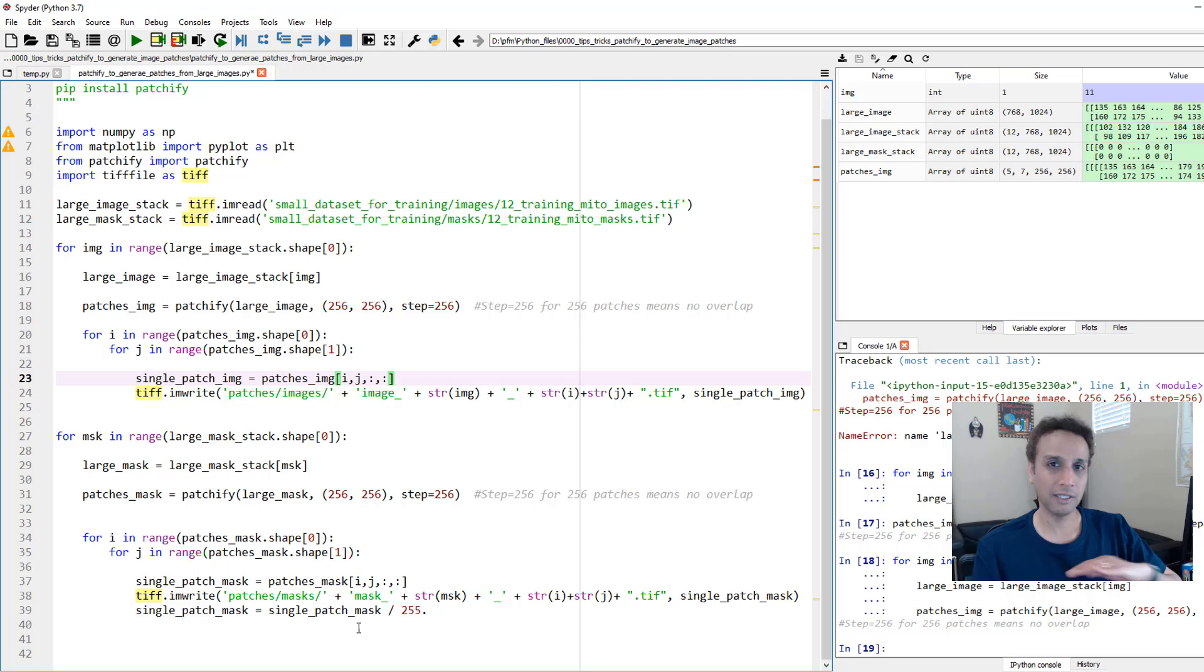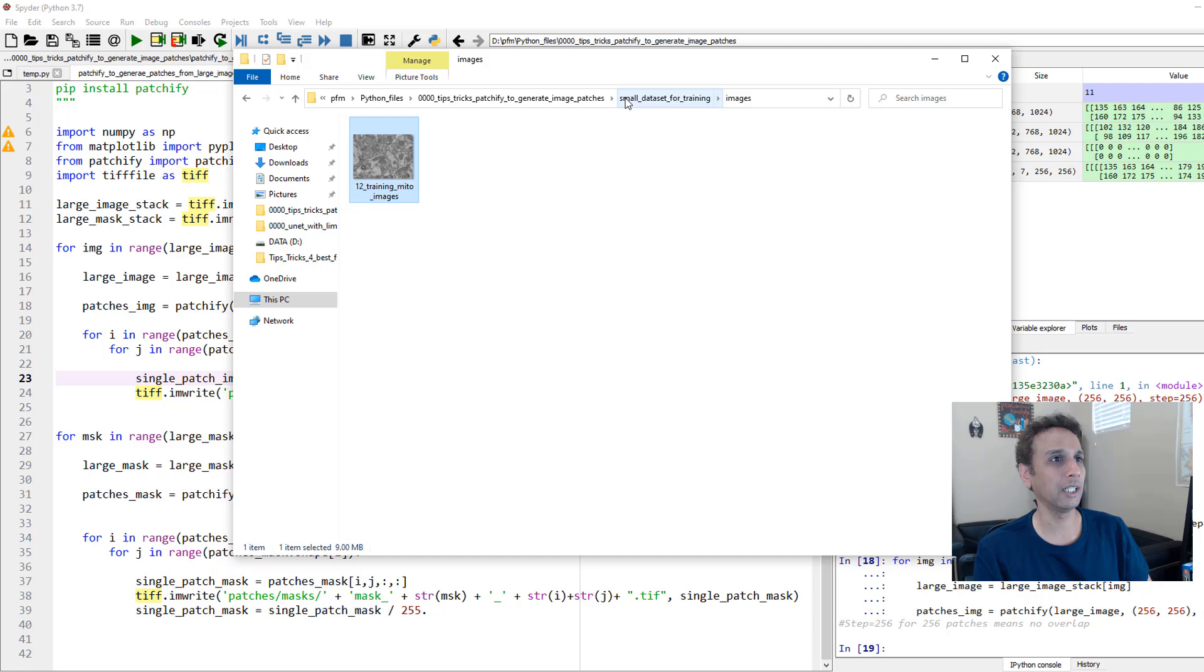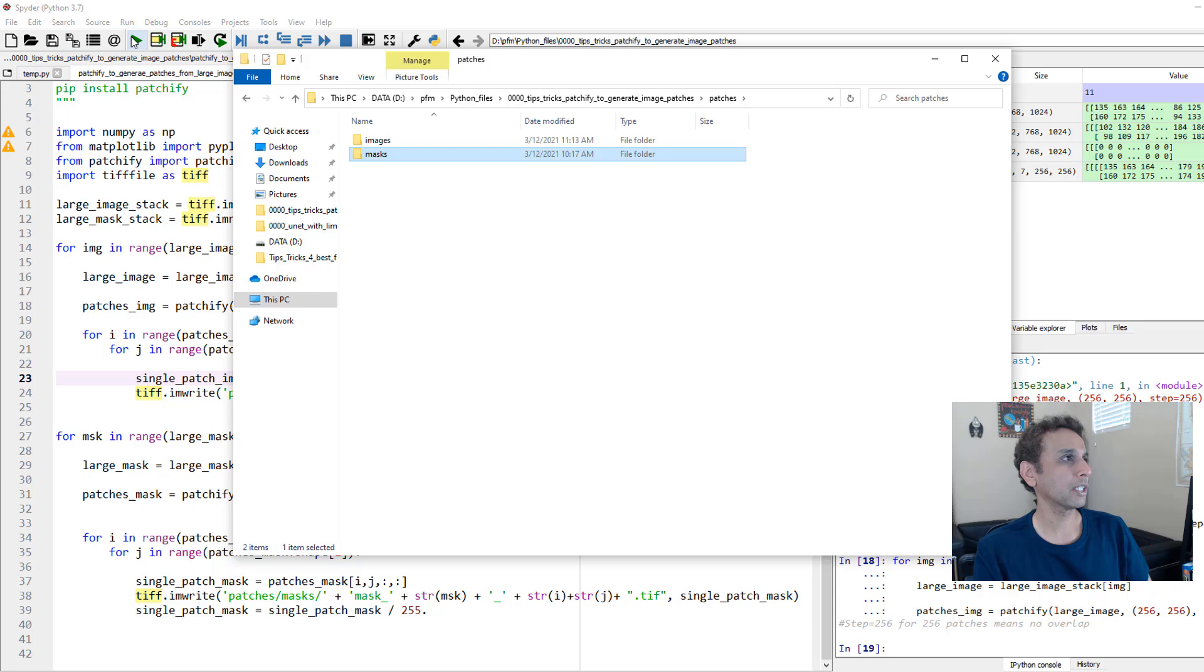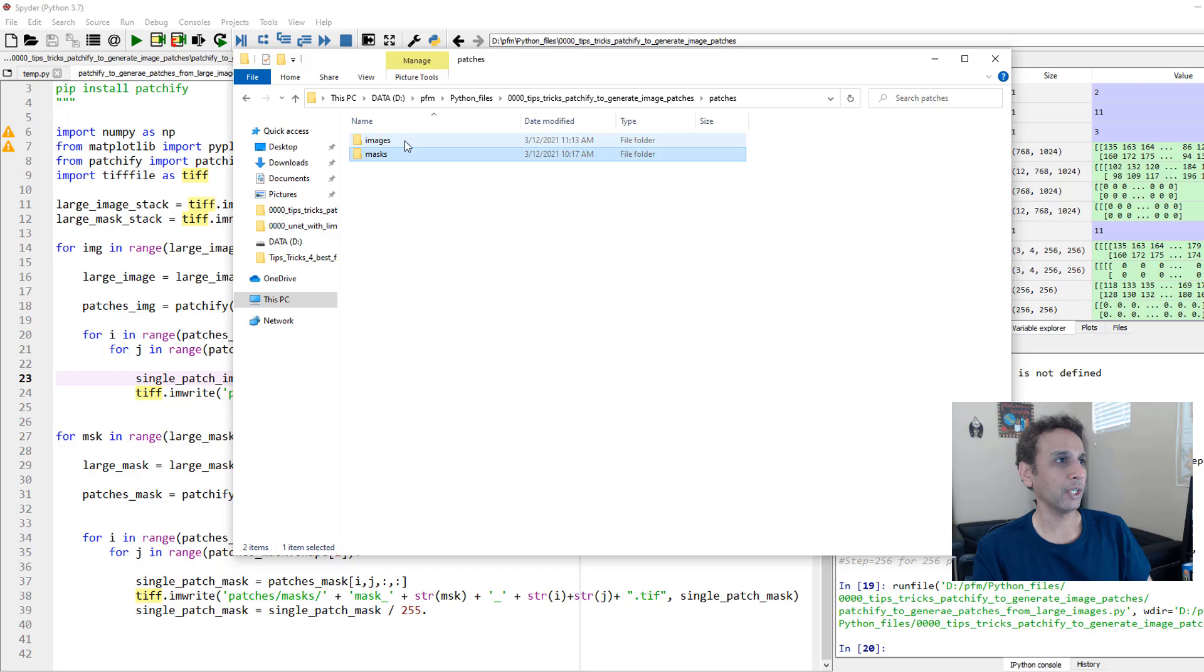Let's go ahead and confirm that there is nothing in our patches folder. In patches, I'm saving images under 'images' here and masks under 'masks'—that's it. So let's go ahead and run this entire code once. It should be pretty fast. I have only 12 images.